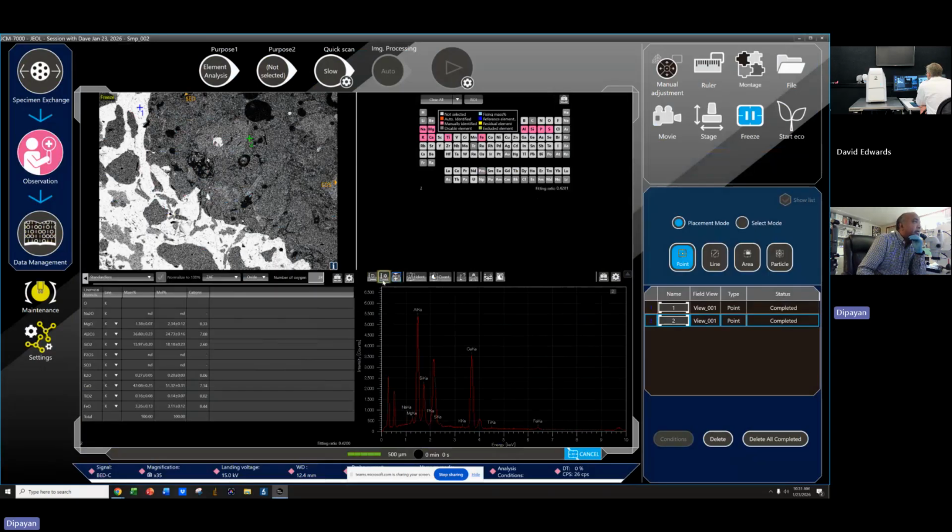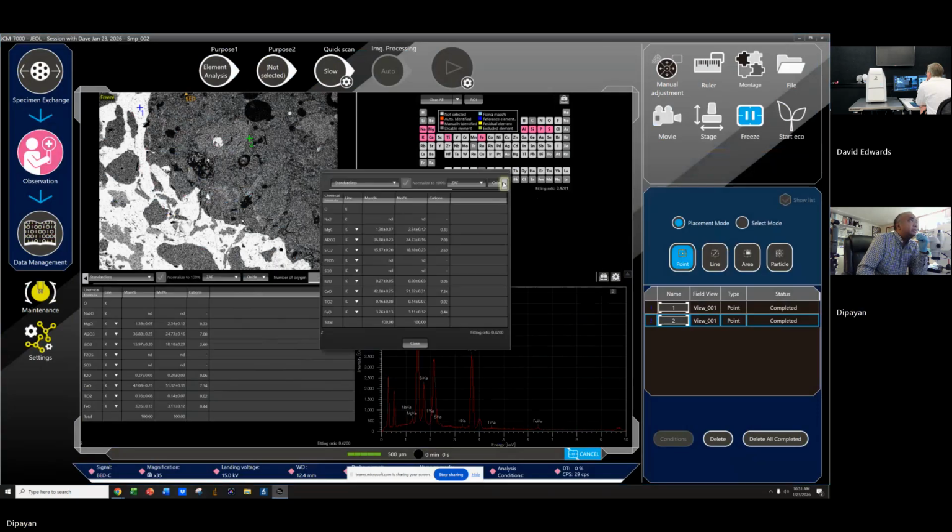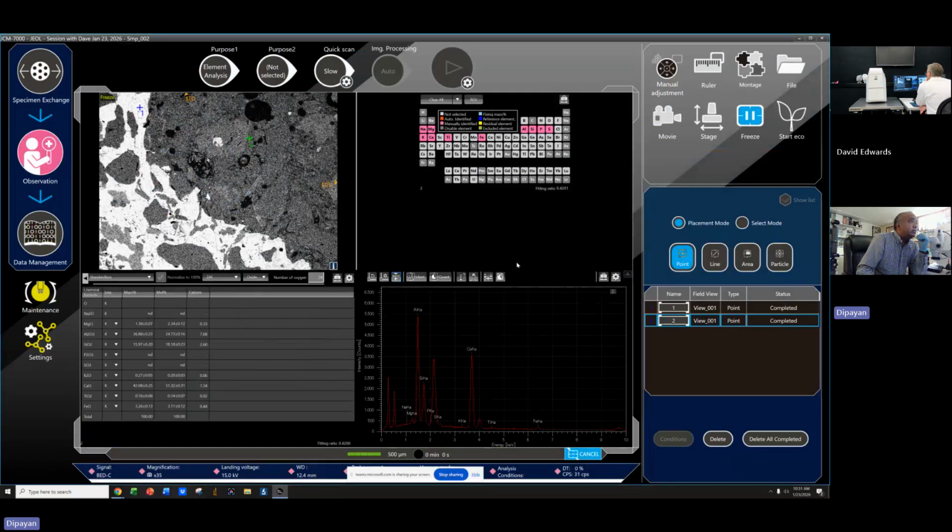Okay. So now, for this one, what I have to do is I can't press the quant button here. So what I was doing before is I was going there. First one is okay, so not now, sorry. So now I basically don't do anything. I go to data management.